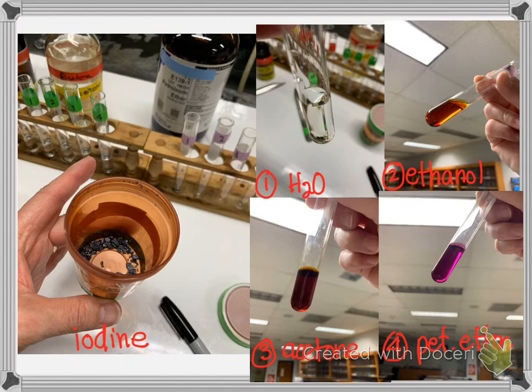And iodine has a formula of I2. And diatomic elements are nonpolar because, remember, nonpolar means that they share the electrons equally. So two iodines would share equally. So if you look, this one is the only one that has solid.